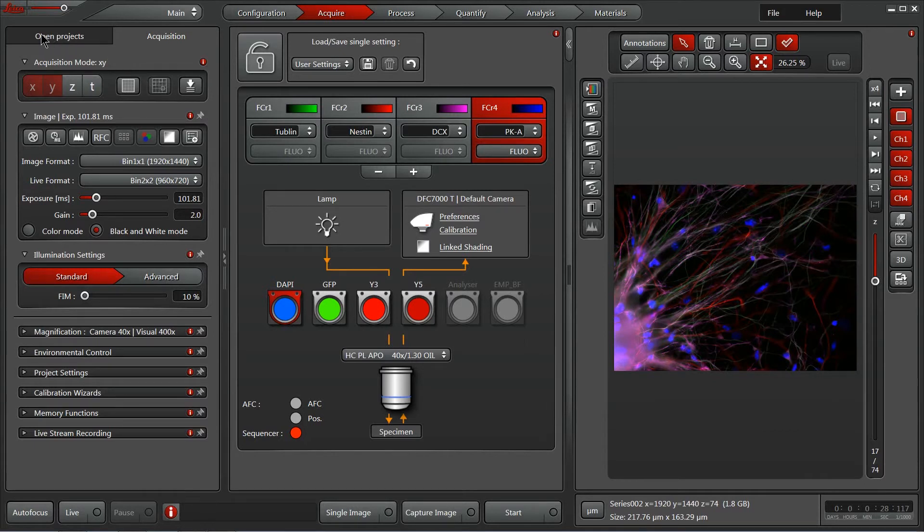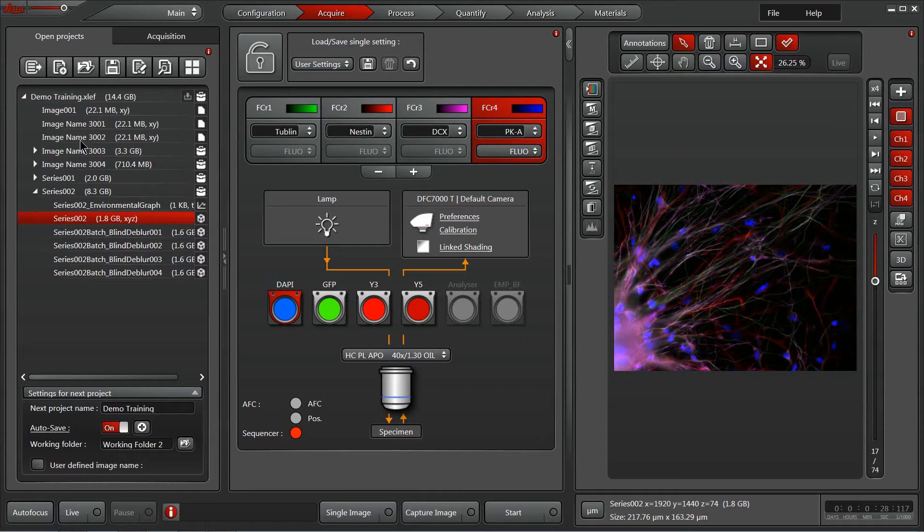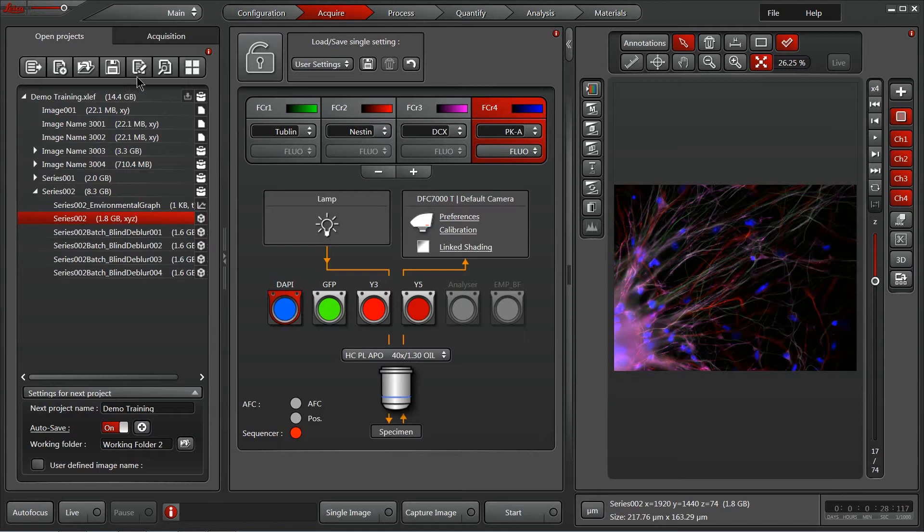Starting with our Projects tab here, this is where you can navigate through acquired projects or open new projects. A project is simply a collection of images or experiments. You can even select an experiment and apply the settings from that experiment to the microscope as a way of quickly reproducing experiment parameters.